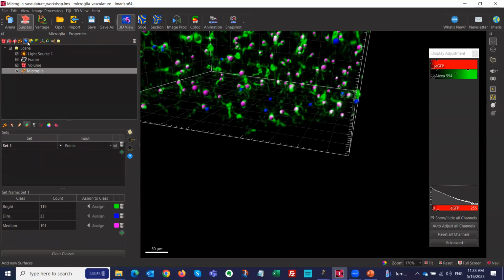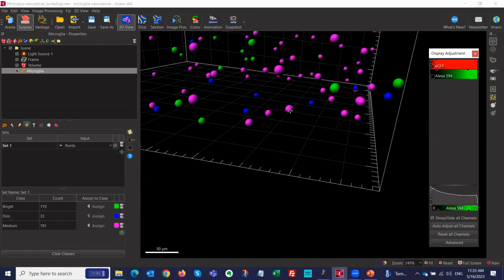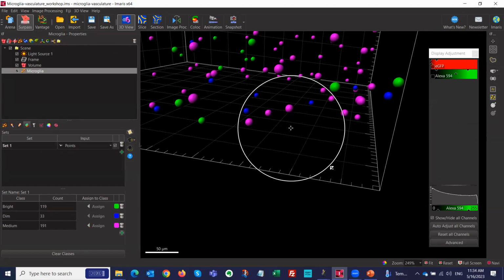So, as you mentioned, for those on Zoom, there's a question about how we can select multiple spots. Just one click will select one spot. If you do shift clicking or control clicking, you can select multiple spots individually. You can also change the cursor from pointer select mode to circle select mode, or press escape. In circle select, you can select multiple spots, and you can make the circle bigger with control, like this.